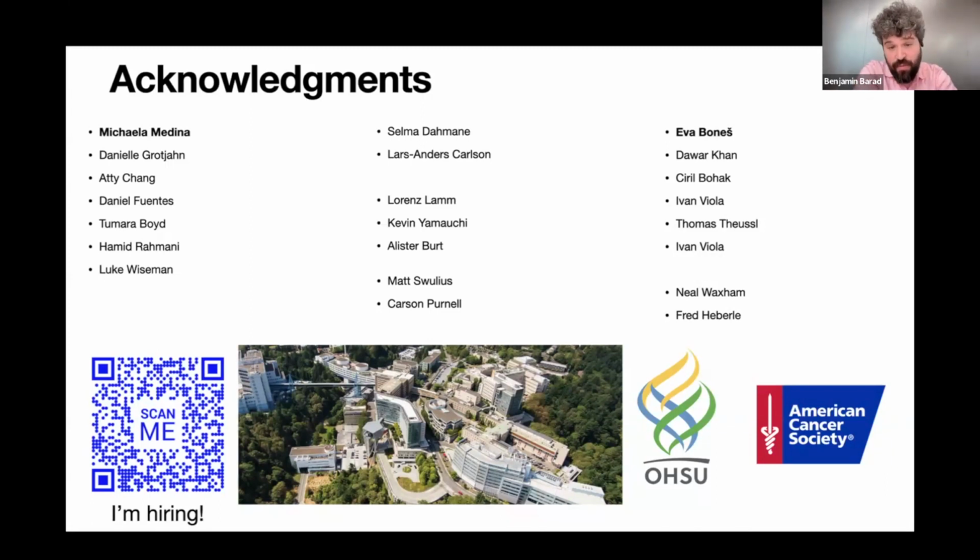In terms of how good the tomogram needs to be, the tomograms that I showed you in the paper were all collected during the pandemic. I was a pandemic postdoc. We were supposed to get our energy filter in June of 2020, and you can imagine that didn't happen. So all of the data I showed was collected without an energy filter. When I look back at it now, it's pretty hard to look at, if I'm being completely honest. I'm not very proud of that data. And you can still get beautiful segmentations from it.